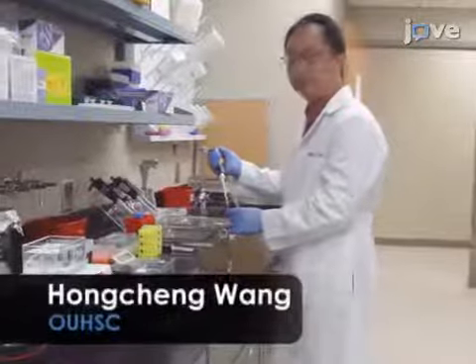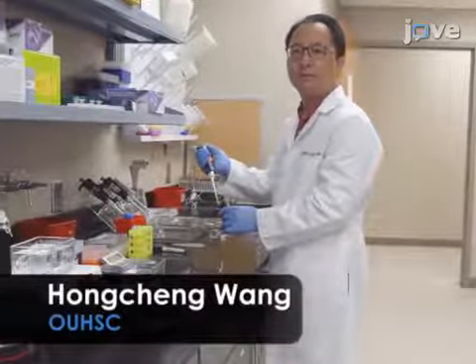The main advantage of this technique is that it is high throughput and sensitive in detecting copy number variations, such as deletion mutations in fast neutron bombardment mutants of the legume plant Medicago truncatula. Demonstrating the procedure will be myself and Hongcheng Wang, post-doctoral fellows from the Genetics Lab.